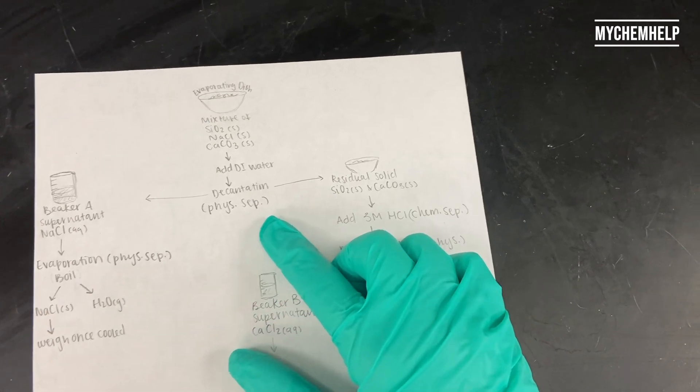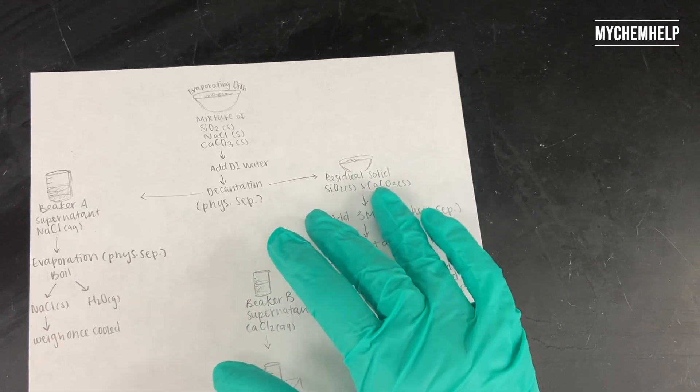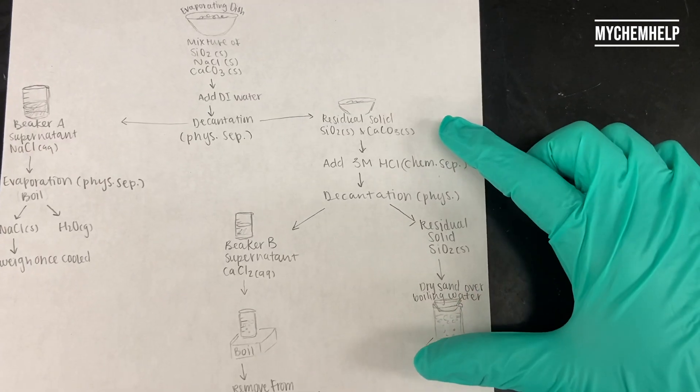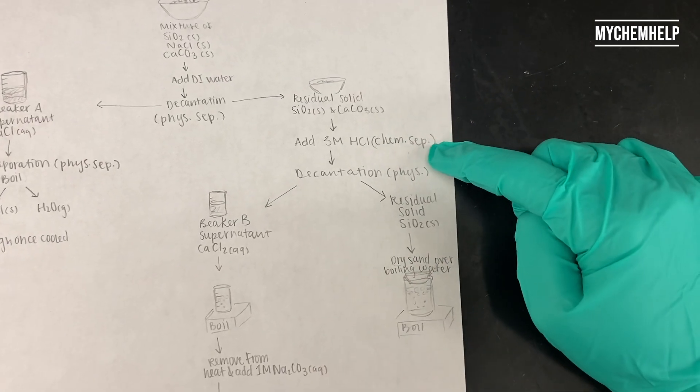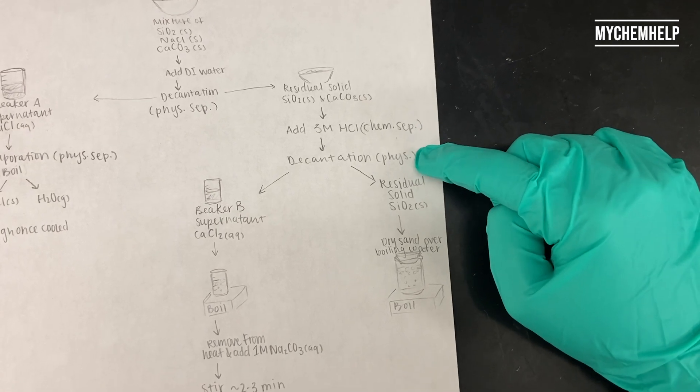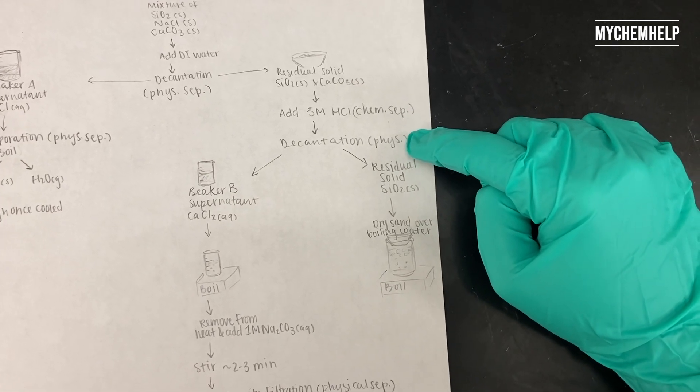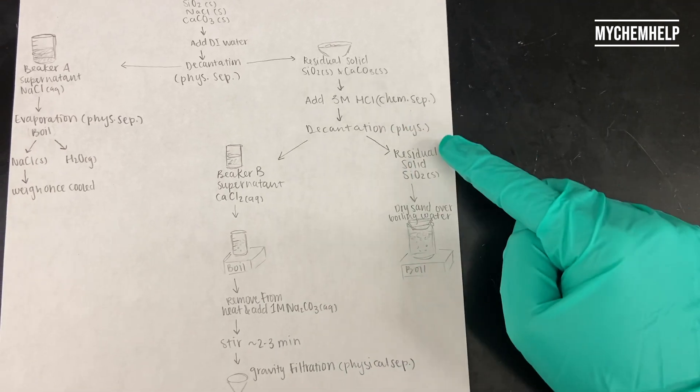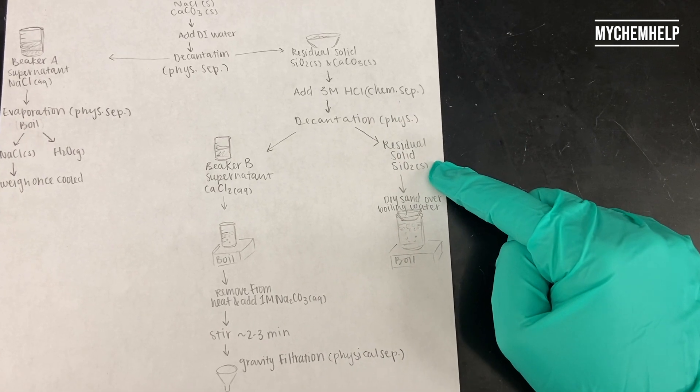So back to the decantation, we have a residual solid of silicon dioxide and calcium carbonate. So in order to separate these two, we're going to add three molar hydrochloric acid, and then do another decantation, and our supernatant is going into beaker B, and the residual solid is just the silicon dioxide.